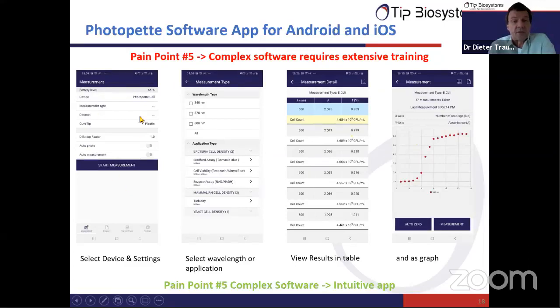This is your landing screen, where you connect through Bluetooth to a Photopette device, and then you can choose what we call the measurement type. If you click on the measurement type, you come to this next screenshot. You can choose the wavelengths, or you can choose an application.